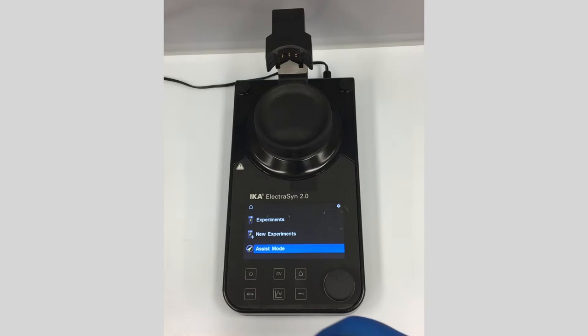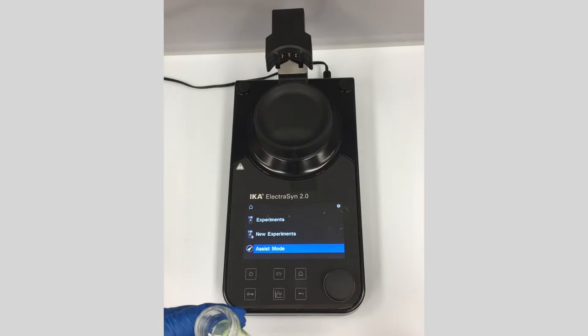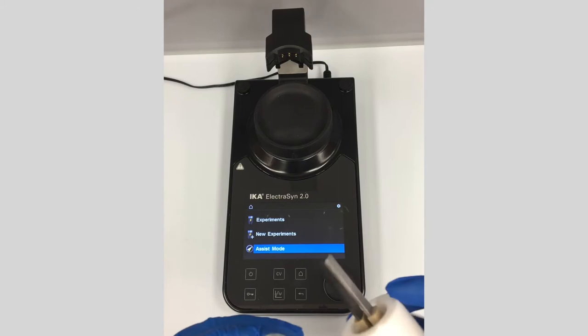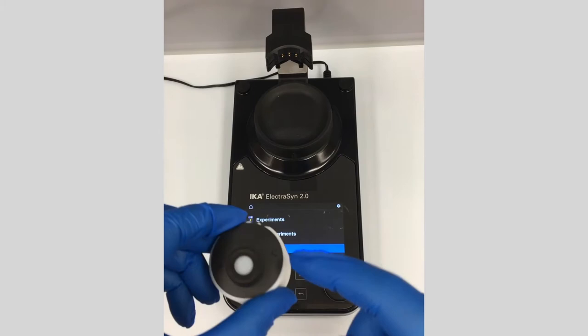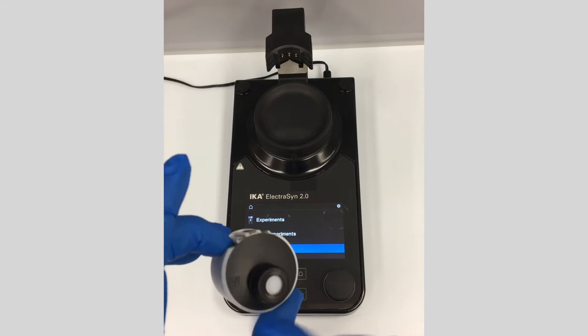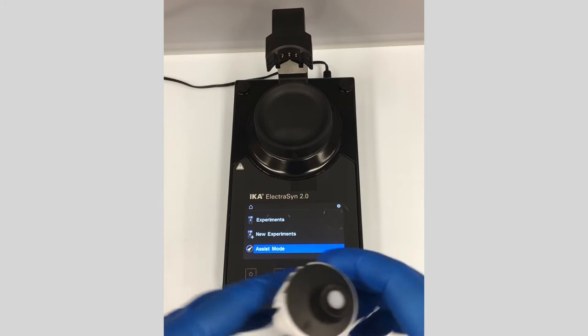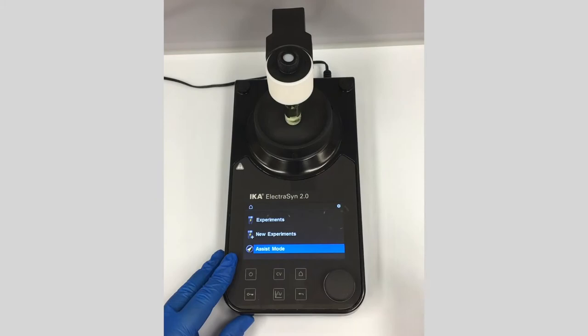Today we're going to run Yu Kawamata's Buchwald amination using electrochemistry with nickel. I have the solution all mixed up here with a stir bar. I'm going to use a stainless steel cathode for the counter electrode and a carbon anode for the working electrode. I'll just fit this together and click it right in.